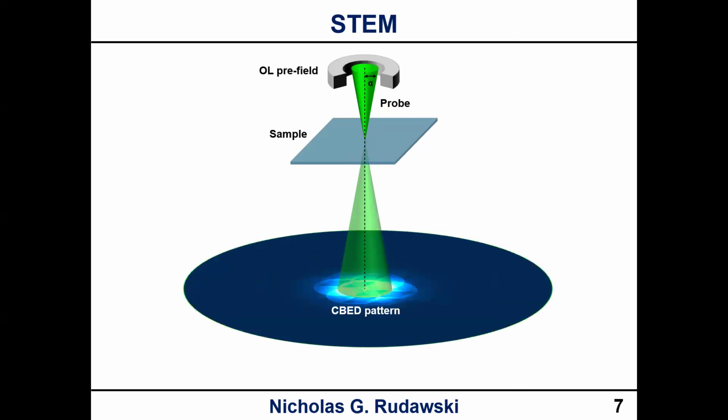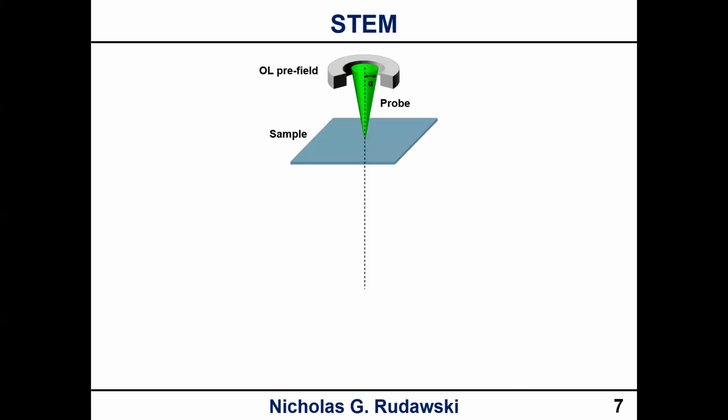Okay, so this semi-angle of convergence, alpha, is ultimately what dictates the depth of field. As alpha gets bigger, my depth of field gets smaller. Believe it or not, people exploit this intentionally.